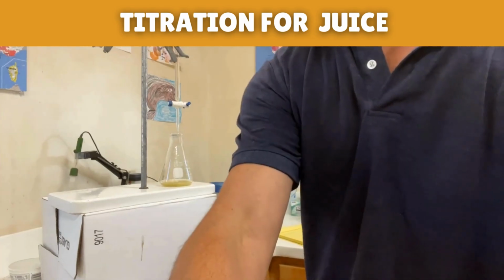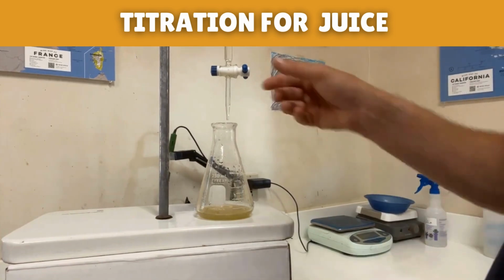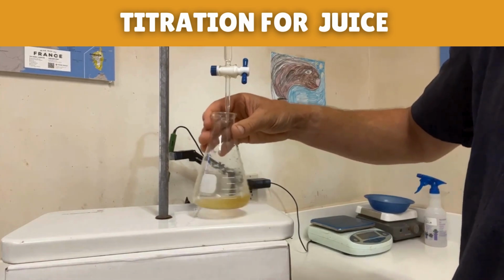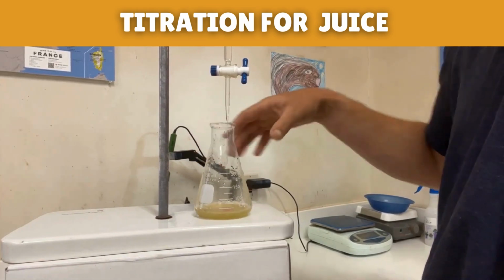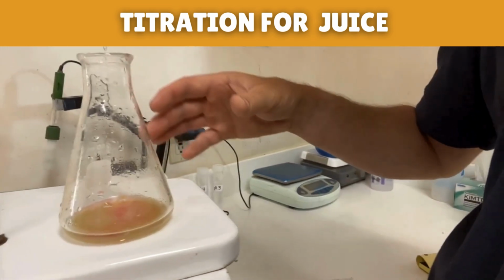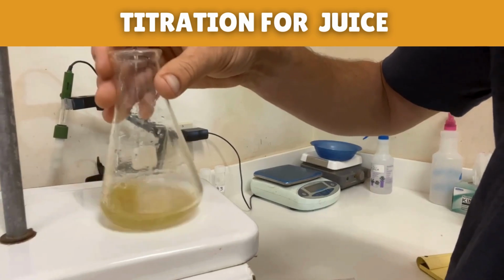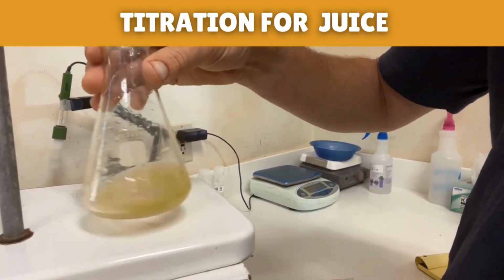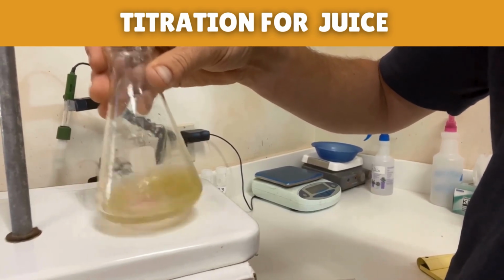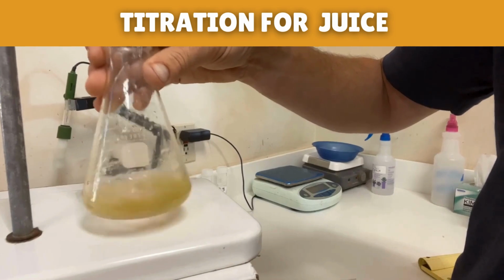Okay, now I'm going to swirl this in, so see this color reaction. So I'm going to open this valve and start delivering the sodium hydroxide down into the juice sample, and you can see there's a bit of a color change there. It's turning pink. Oh well, it comes through in the video, but the pH of the juice is constantly increasing as we're adding the sodium hydroxide. We're shooting for pH 8.2. That's when everything is going to turn pink and remain pink.